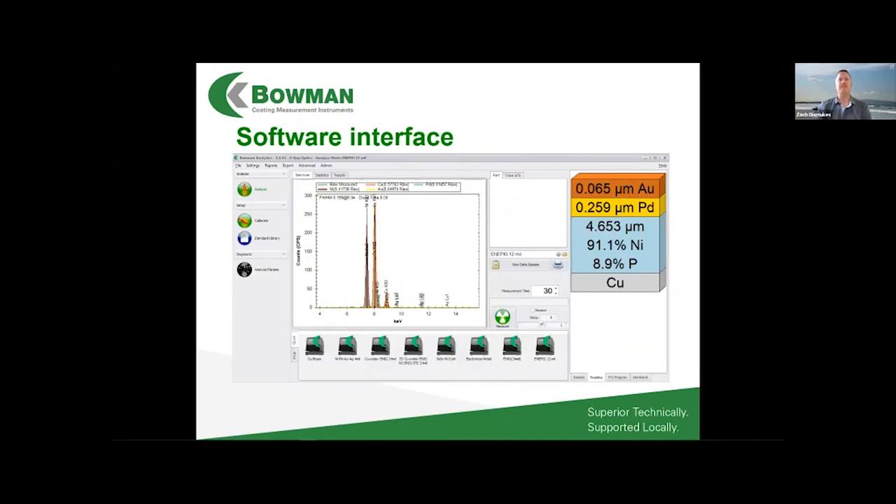Here's a snapshot of the software interface. Any coating thickness XRF system will have a spectrum view of the raw data being collected, a selection of applications — important for job shops running 50 different processes covering silver, tin, cadmium, zinc, gold, nickel, and more — and on the right side a readout showing the actual coating layers with a diagram of how they're plated and the thickness breakdown. If it's an alloy, the composition of that plating layer is shown as well.